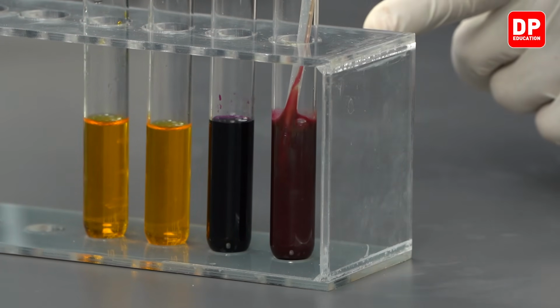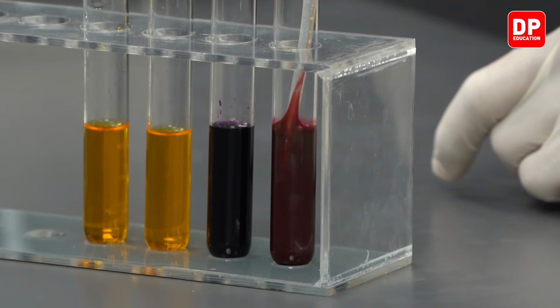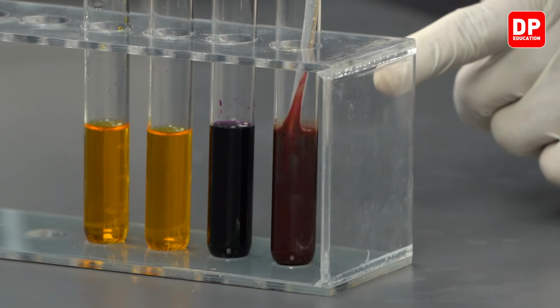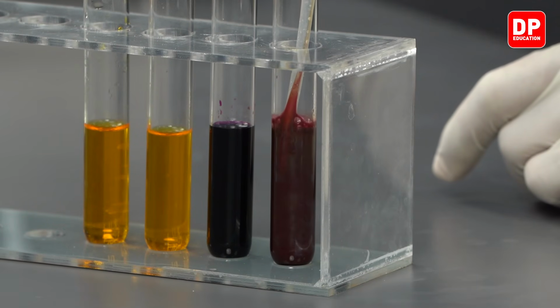As you can see, students, as we send sulfur dioxide through the acidified potassium permanganate solution, we can very clearly see the solution becomes colorless gradually. So now the acidified potassium permanganate solution is less purple compared to the control that we have right next to it. Gradually it loses its color.